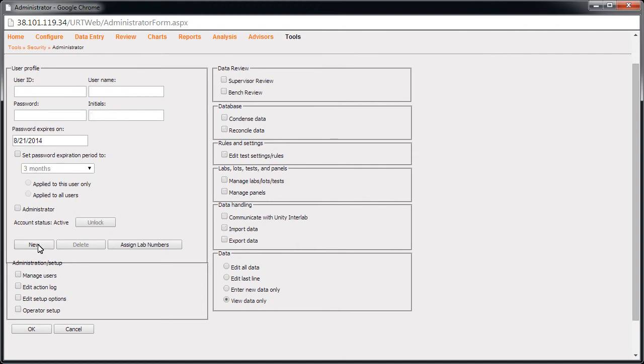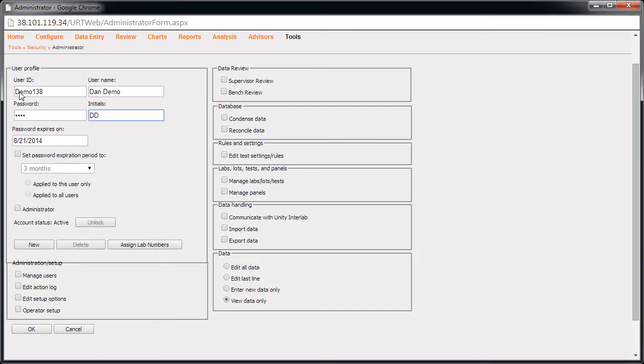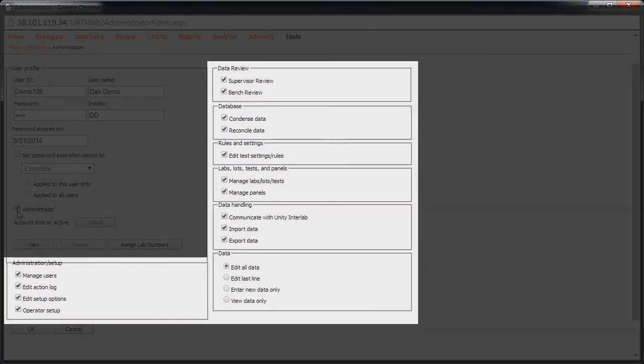Click New. Enter the user ID, user name, password, and initials. Clicking this checkbox gives the user all of the permissions. These are the permissions. Refer to the user guide for more details. Click OK.